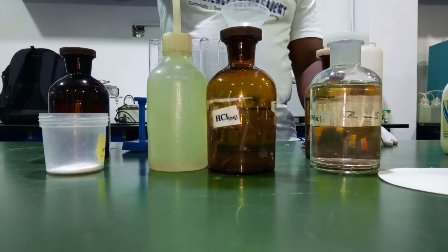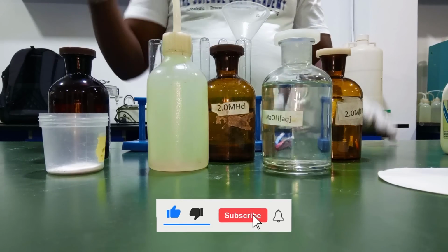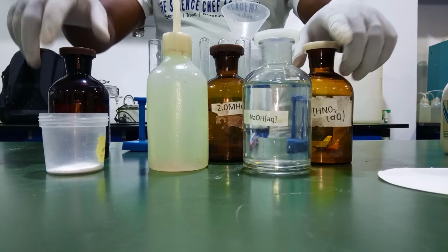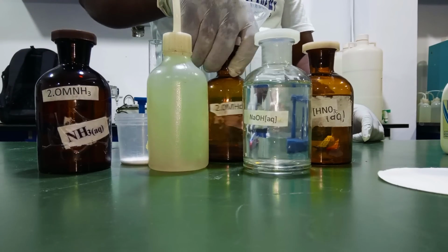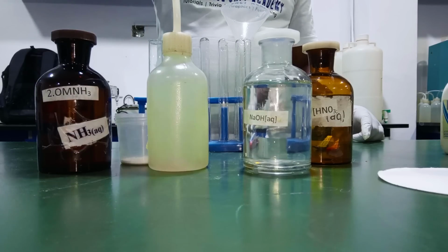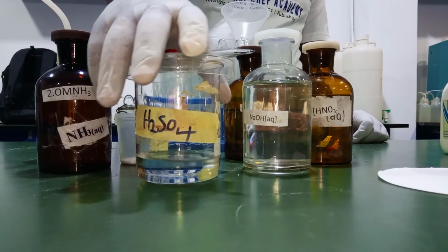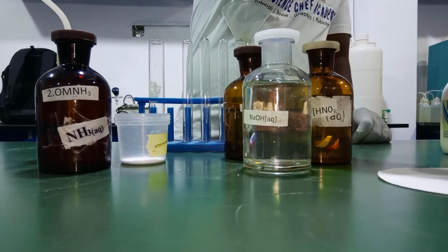And then we have the reagents to test for the cations and the anion. We have sodium hydroxide here. We have 2 molar HNO3. We have 2 molar ammonia solution, bench reagent, and we have 2 molar HCl here. Then we have our wash bottle. Then we also have concentrated H2SO4, concentrated H2SO4 for the brown ring test.